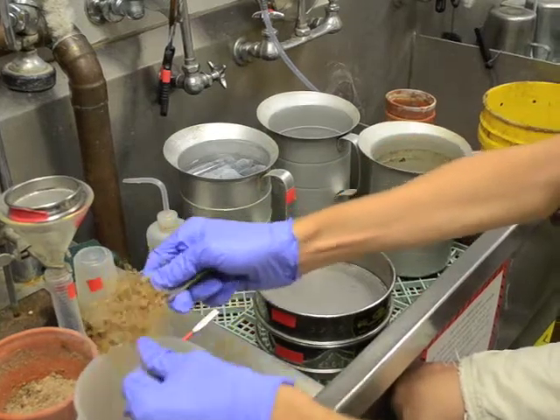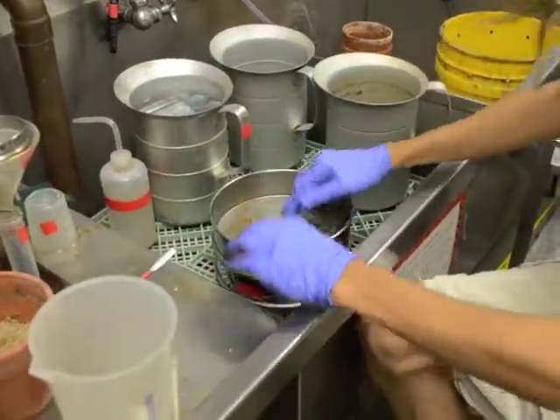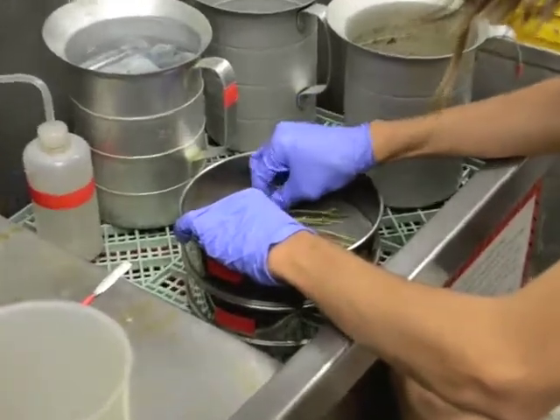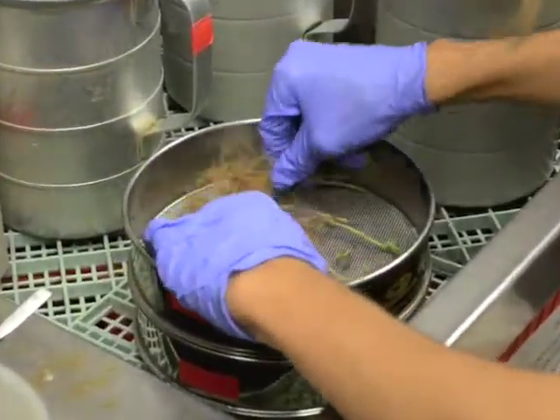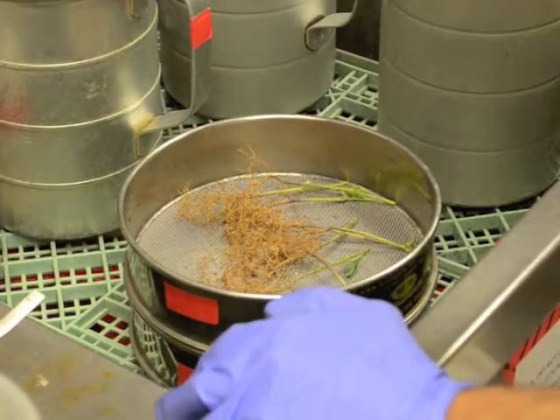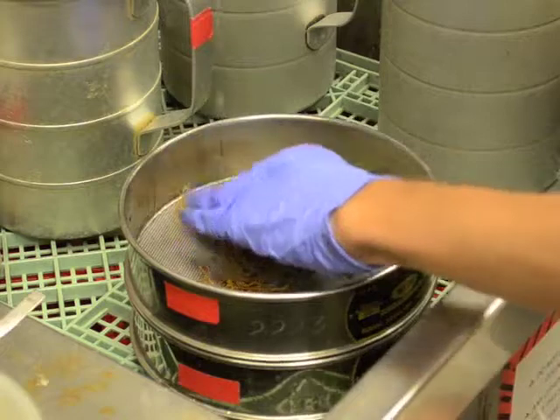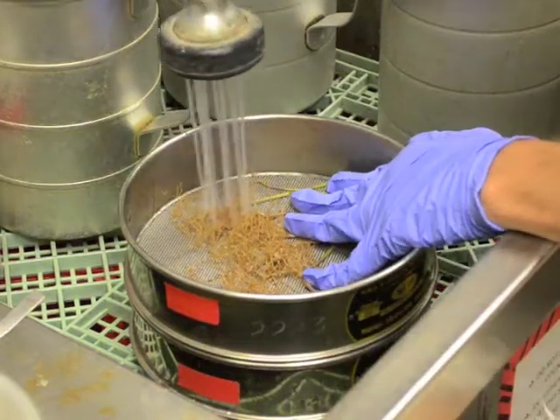Place the roots onto two stacked sieves: a 60 mesh on the bottom and 20 mesh on the top. Spread the roots evenly across the top sieve. Blast the roots with a forceful stream of water to dislodge the cysts from the plant roots.